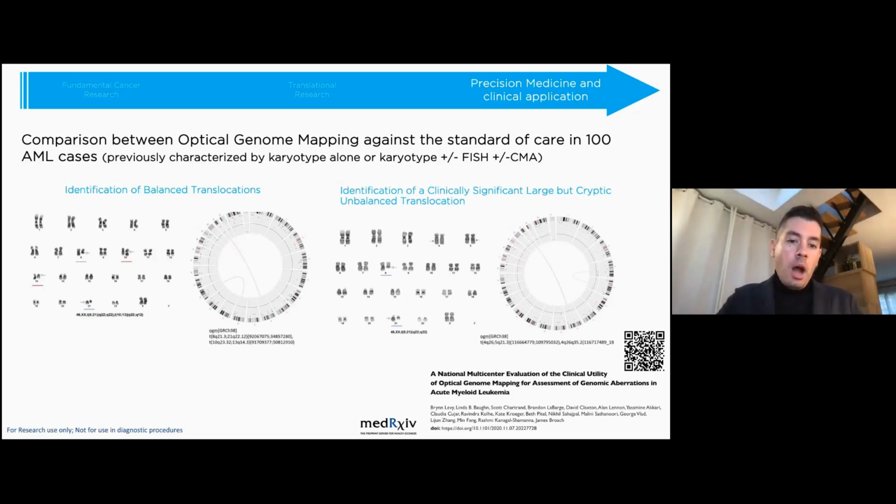And since optical mapping is a new technology, the authors modeled the optical mapping nomenclature on the array nomenclature described by ISCN 2016. But since microarray technology cannot detect balanced rearrangements, they have proposed a unique nomenclature using this ISCN logic that you can see over there.